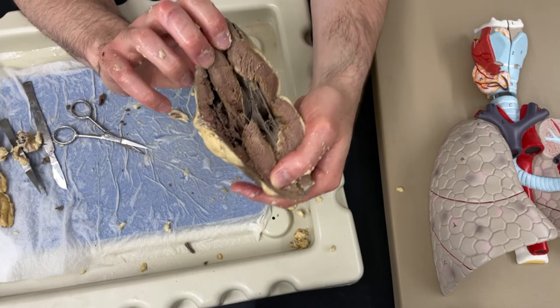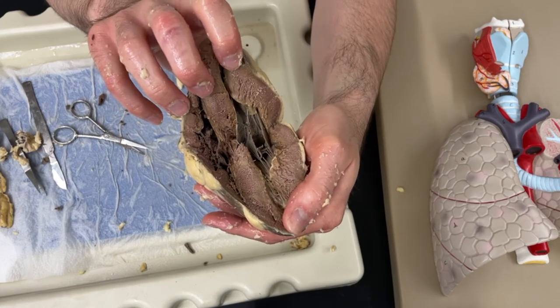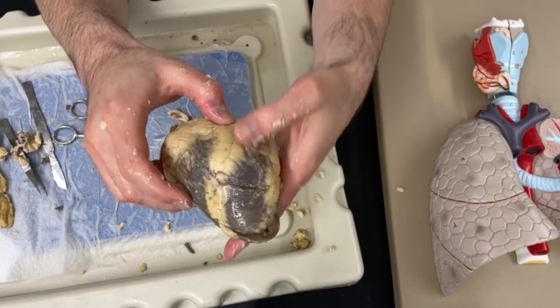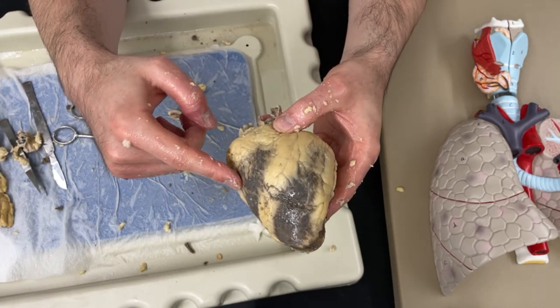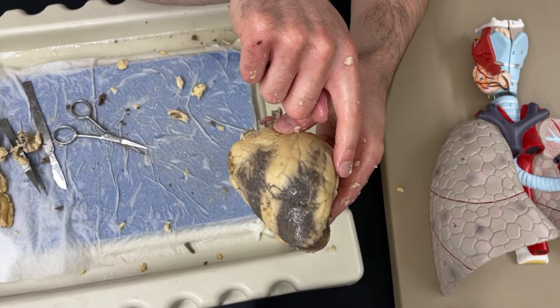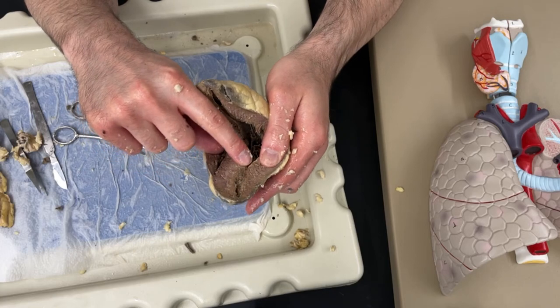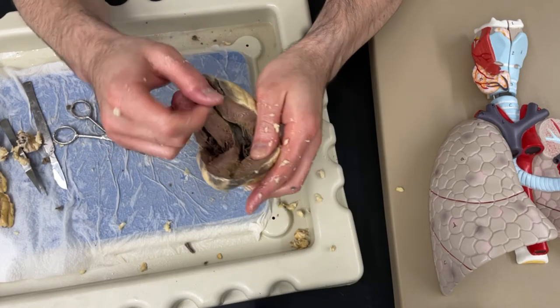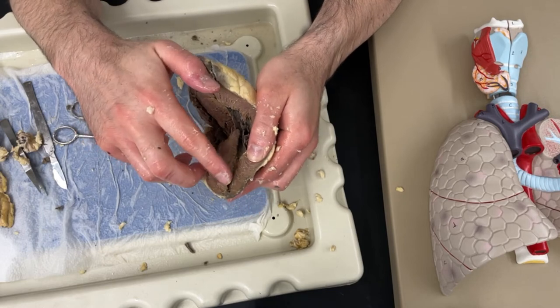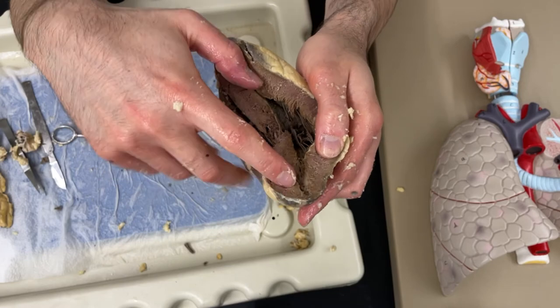Now I'm going to use my scissors and start to cut through some of that septum in the middle, and it should start to open up a little bit more. It should start to kind of open up like this and then we can see those chambers of the heart - you can also pull on it a little bit to get that to open up. I've got this as the right side of the heart and this as the left side. The chamber that goes all the way down to the tip or the apex of the heart is always going to be the left ventricle - so if you're ever trying to figure out where you are on the heart, that's one helpful clue.